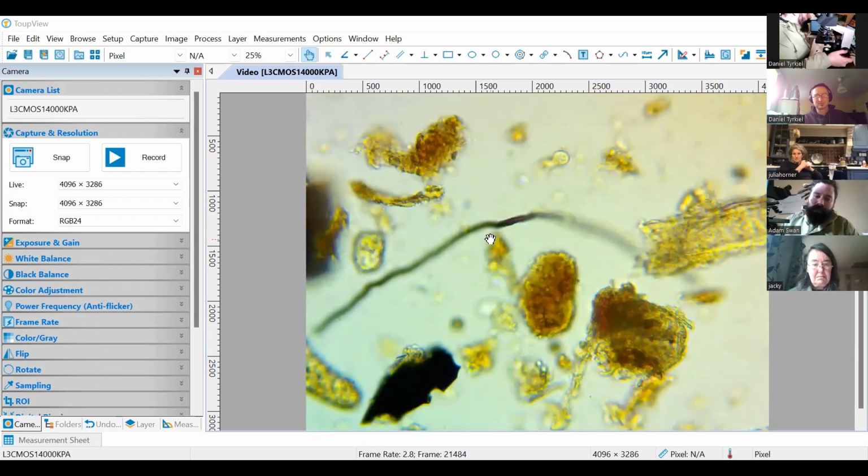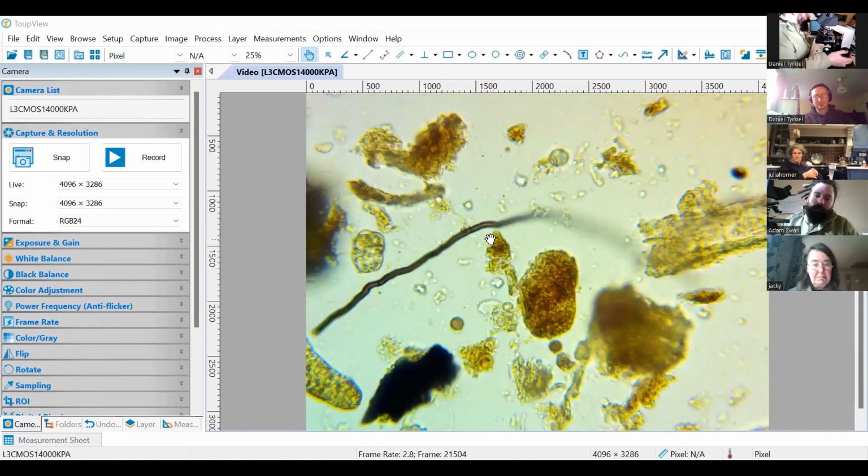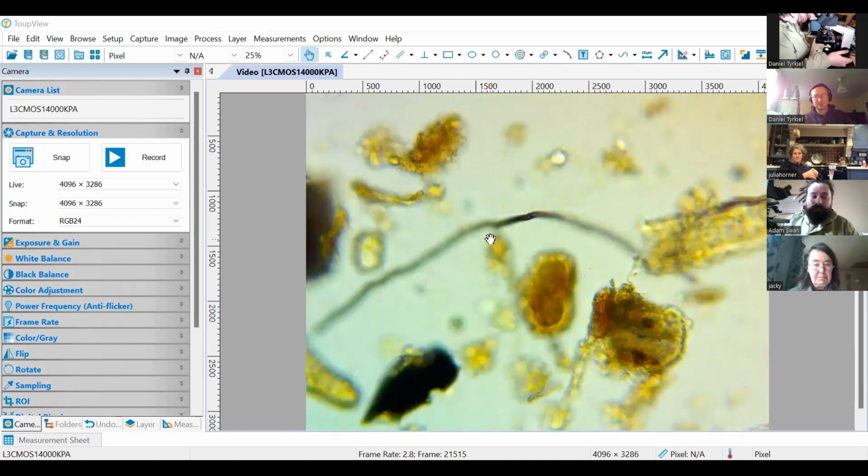We just count it as one diameter of our field of view. If we were to subdivide that, we would express it in decimals on the sheet. So 0.1 of a diameter, 0.2, 0.25, something like that. That's how we would derive the length.